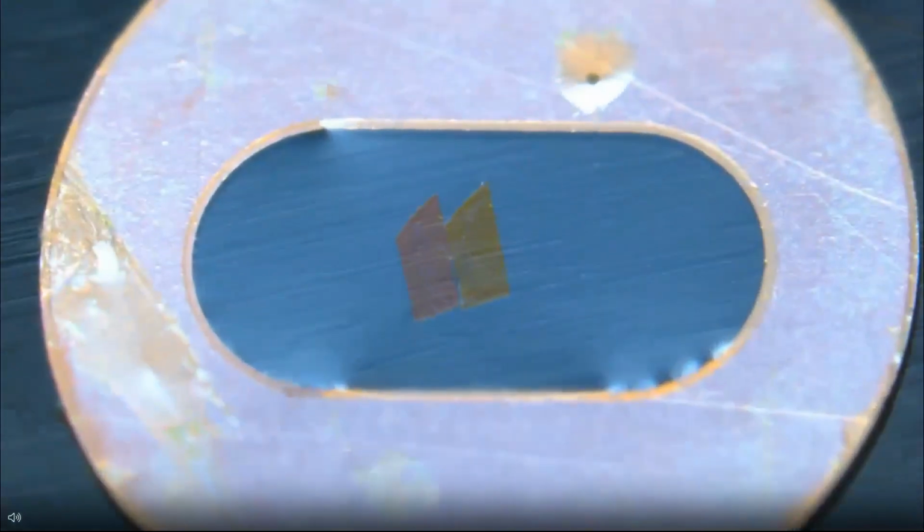We picked them up on a slot grid. And here they are on the same fluorescence microscope. We could just see the pharynxes, the pharynx really nicely.